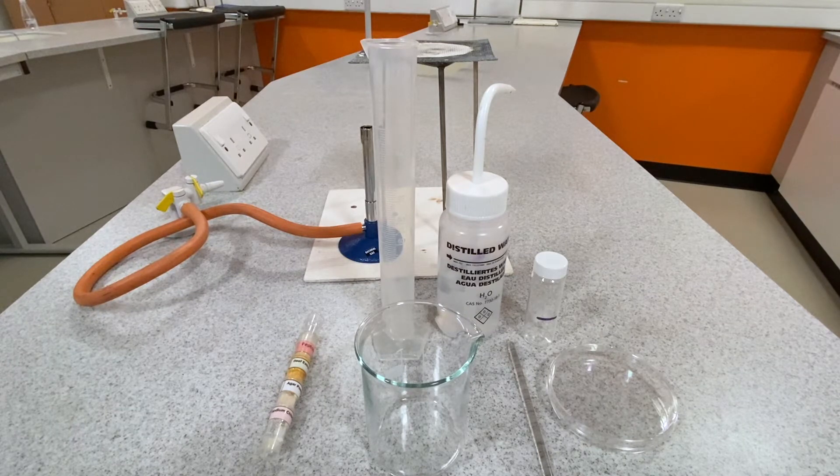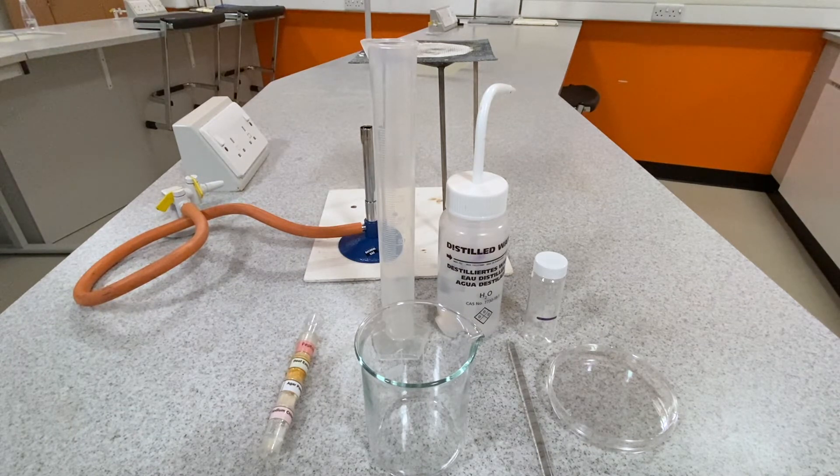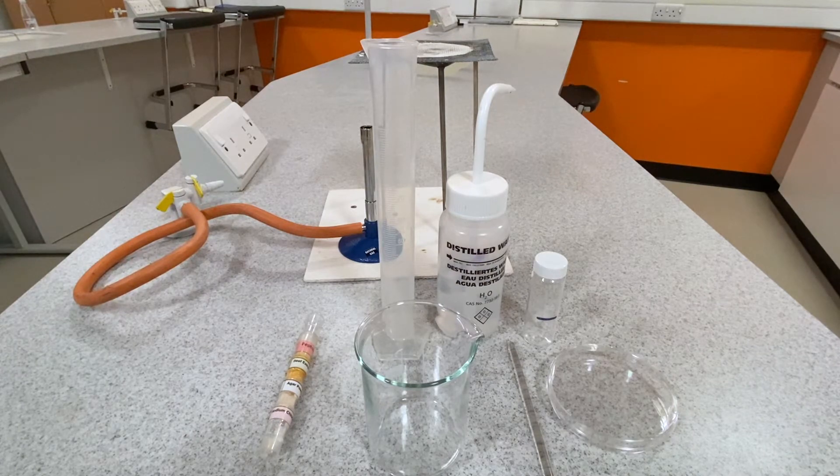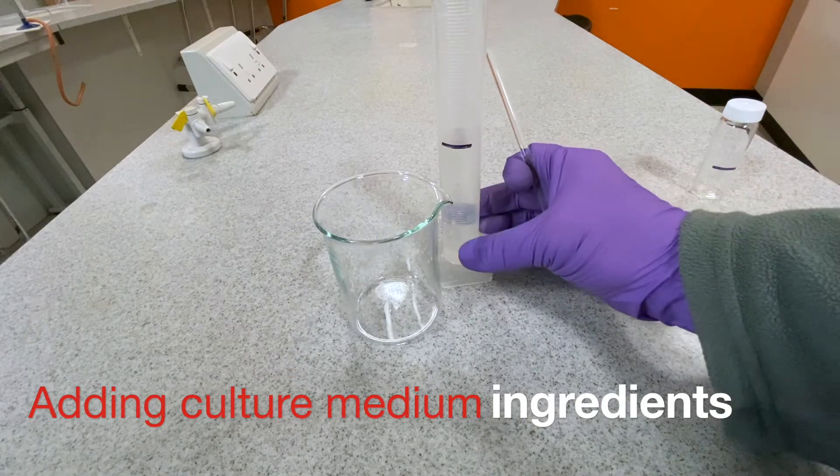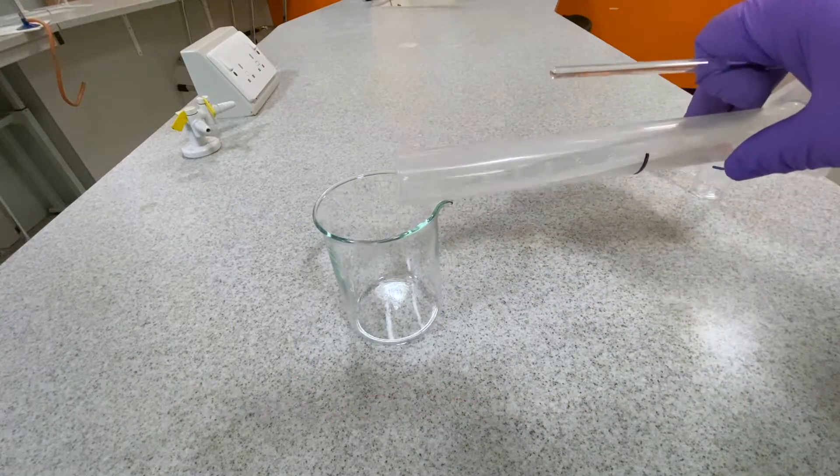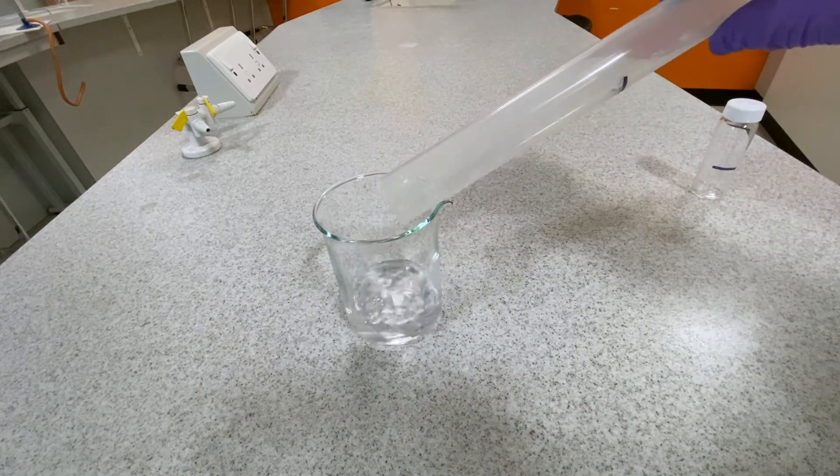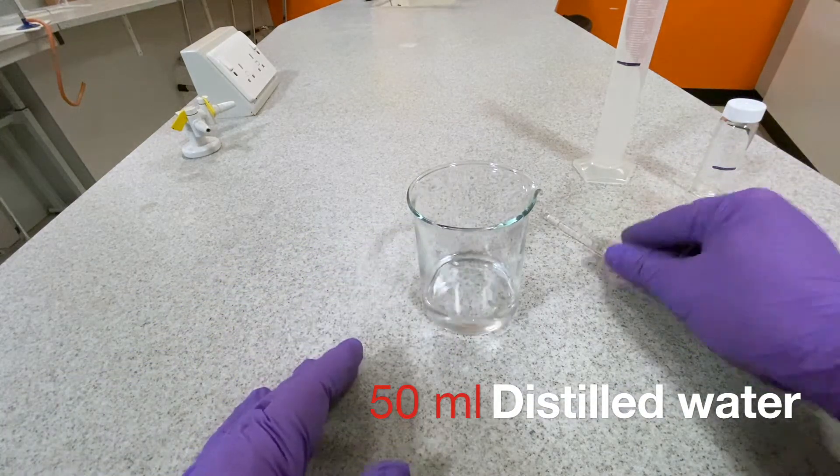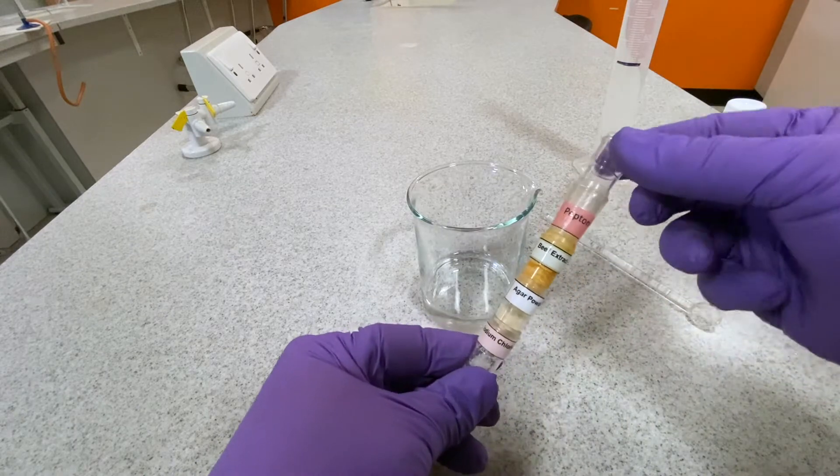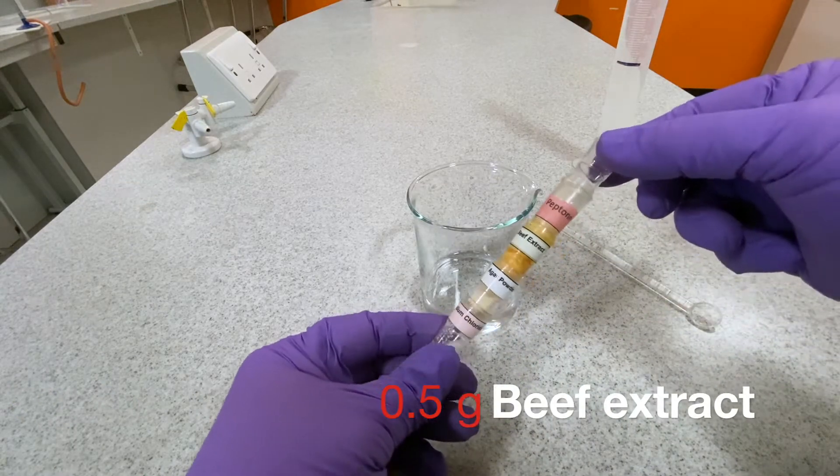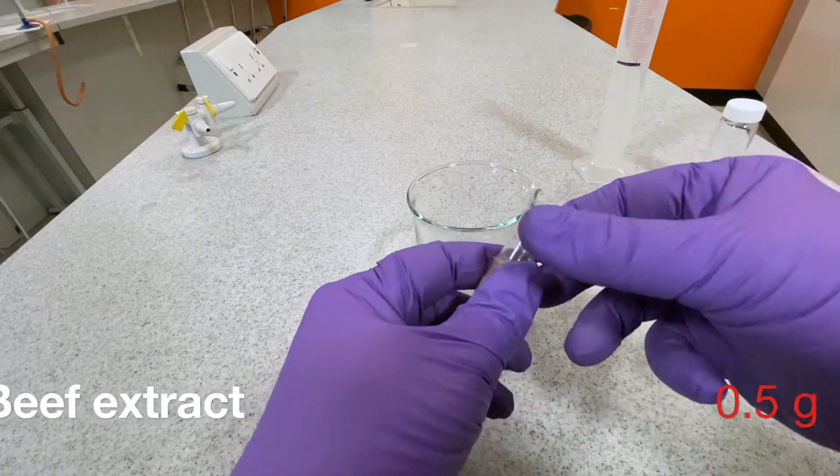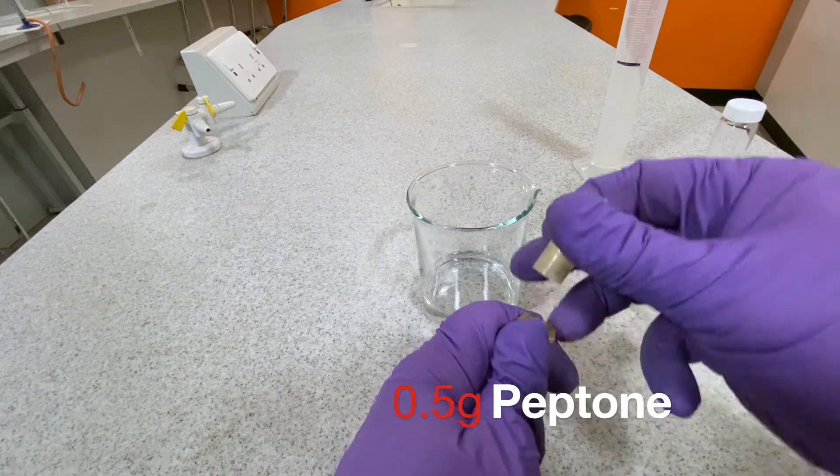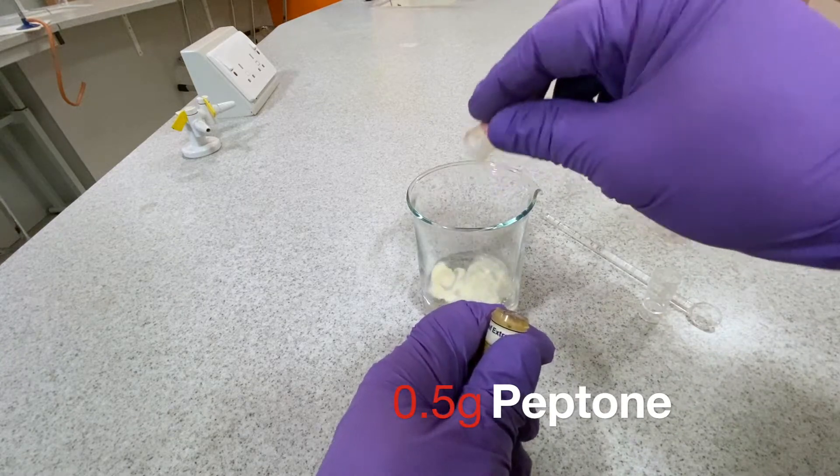Making the culture medium. Measure out 50 milliliters of distilled water into the 100 milliliter measuring cylinder. Pour the water into the 250 milliliter beaker and add the solid ingredients which are pre-weighed in the small pots. The list of ingredients and their weights are shown on screen.